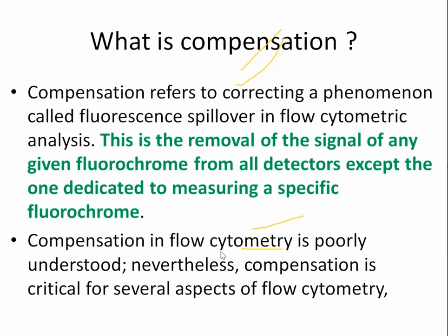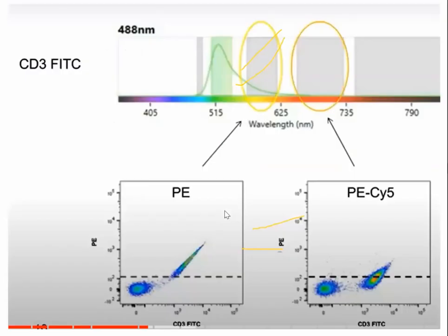Compensation is very important, and sometimes it's not understood and we just ignore it, which can lead to very bad results, and even wrong diagnosis.